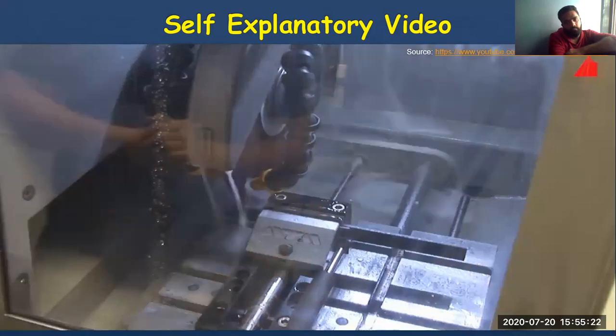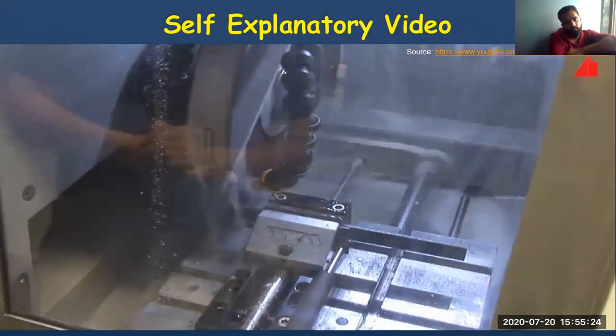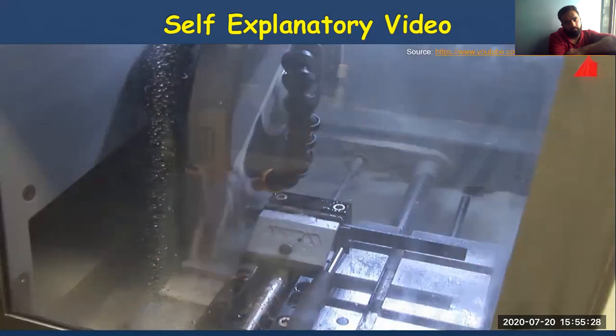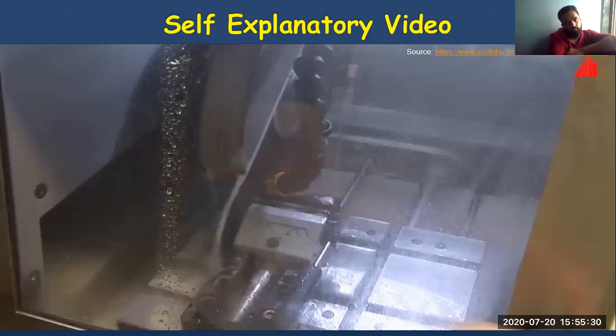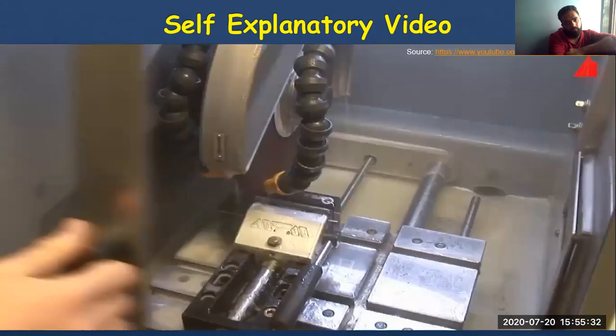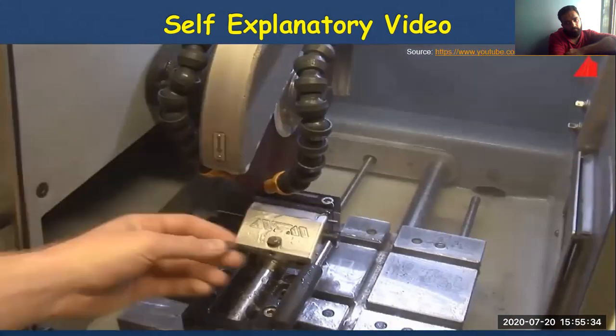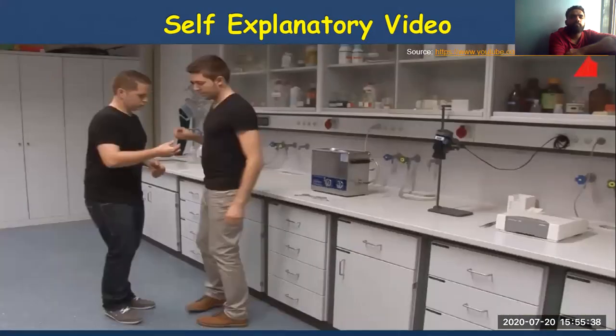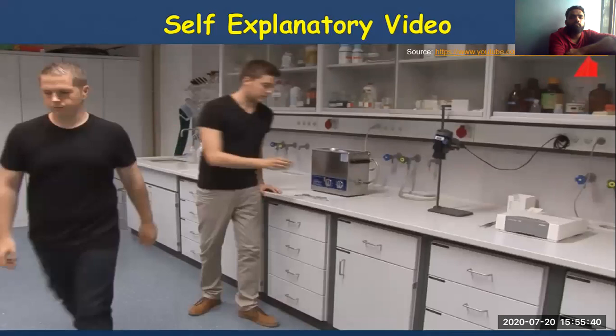Intensive water cooling and appropriate cutting parameters are important to keep the material as cool as possible. After finishing all abrasive cuts, the material tester picks up the sample and hands it over to his colleague. For further processing, the specimen has to be mounted in resin.